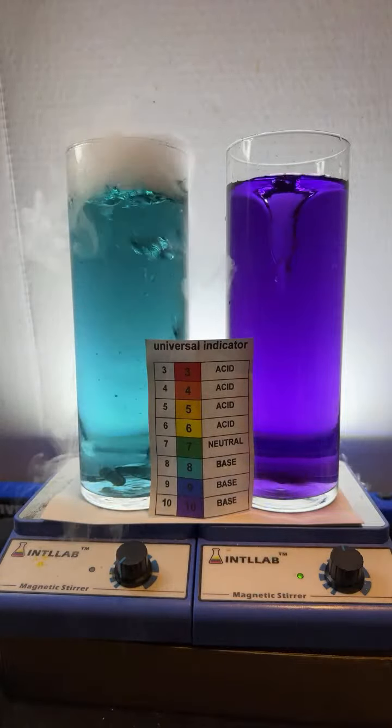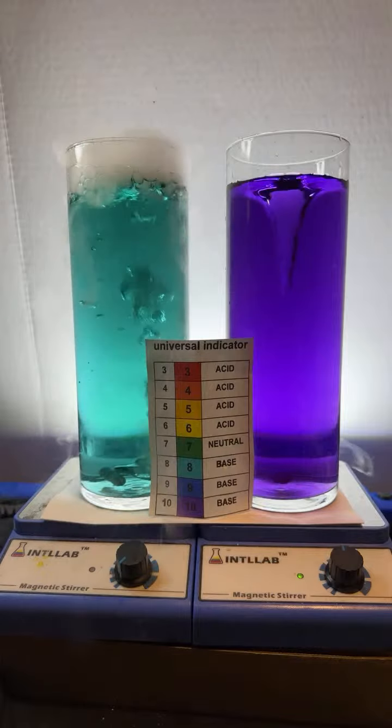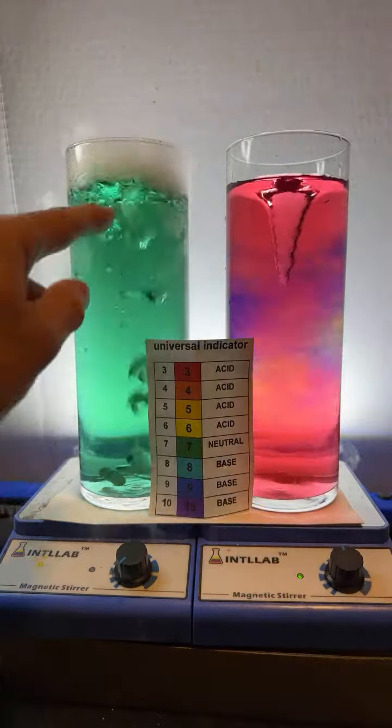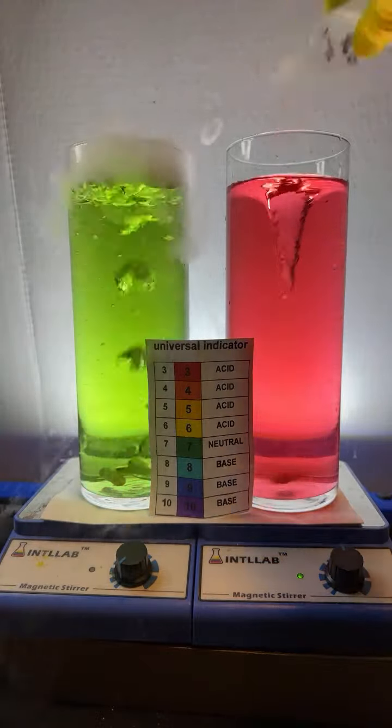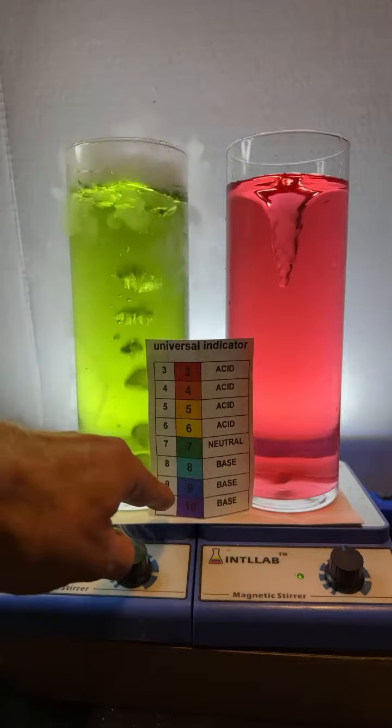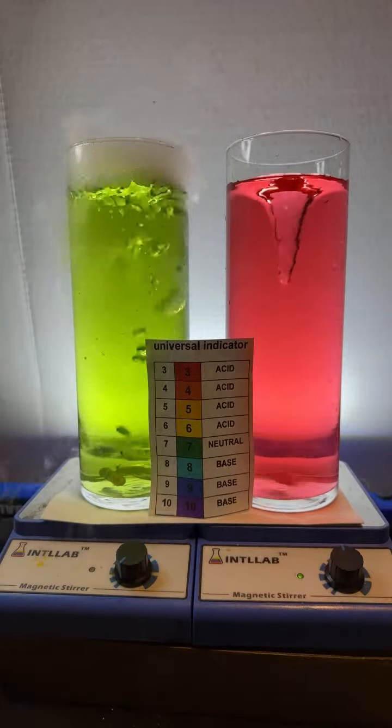What does pH 1 look like? Here, let's show you. Well, pH 1, so pH 3 and below, it's all going to look red. So anything below pH 3 is going to stay red. Anything above pH 10 is going to stay violet.